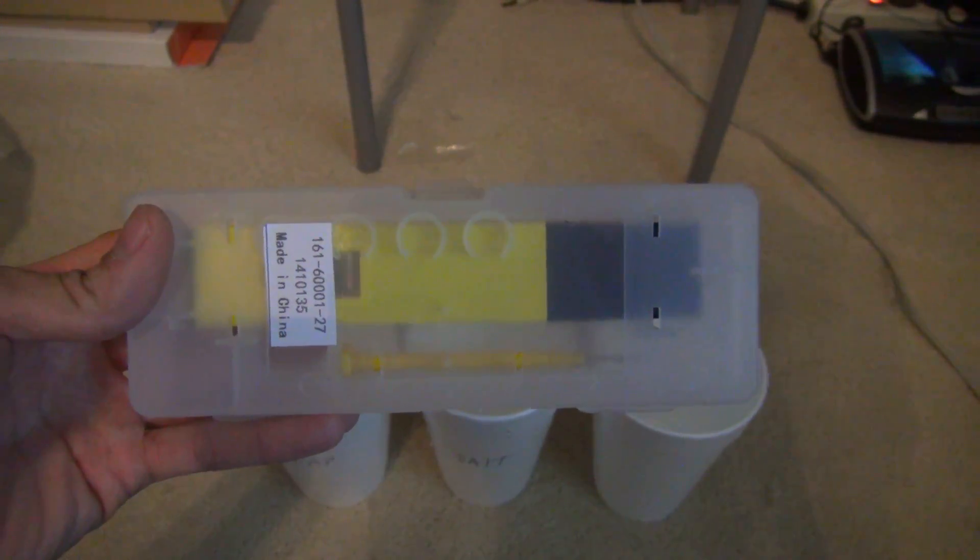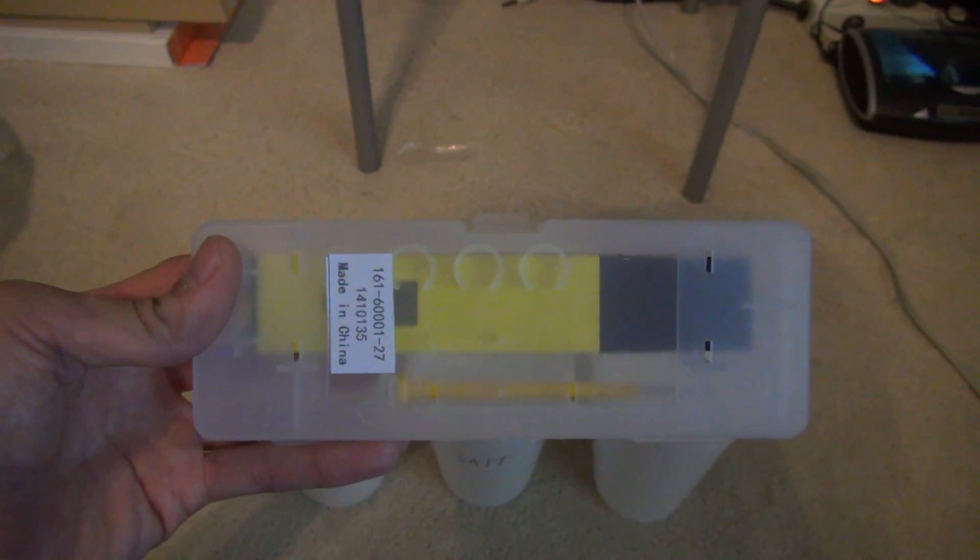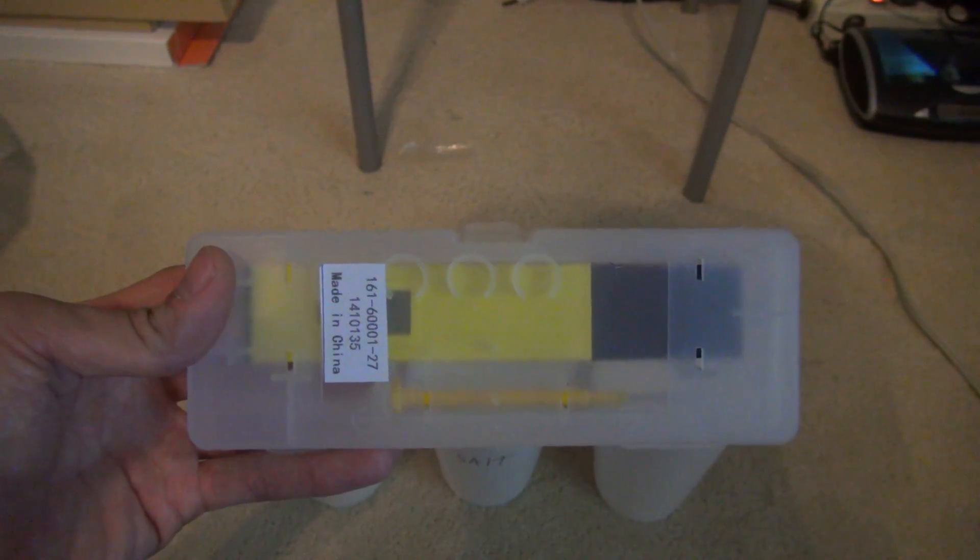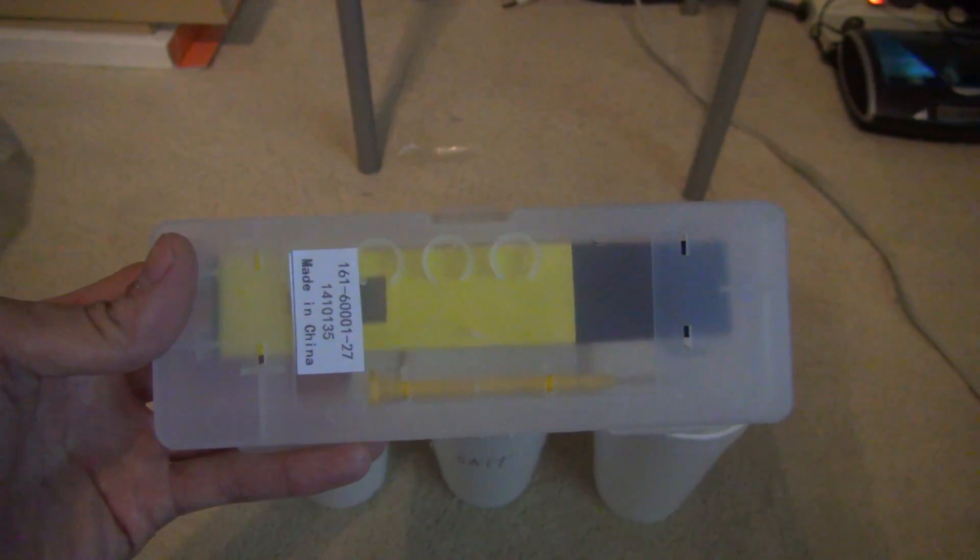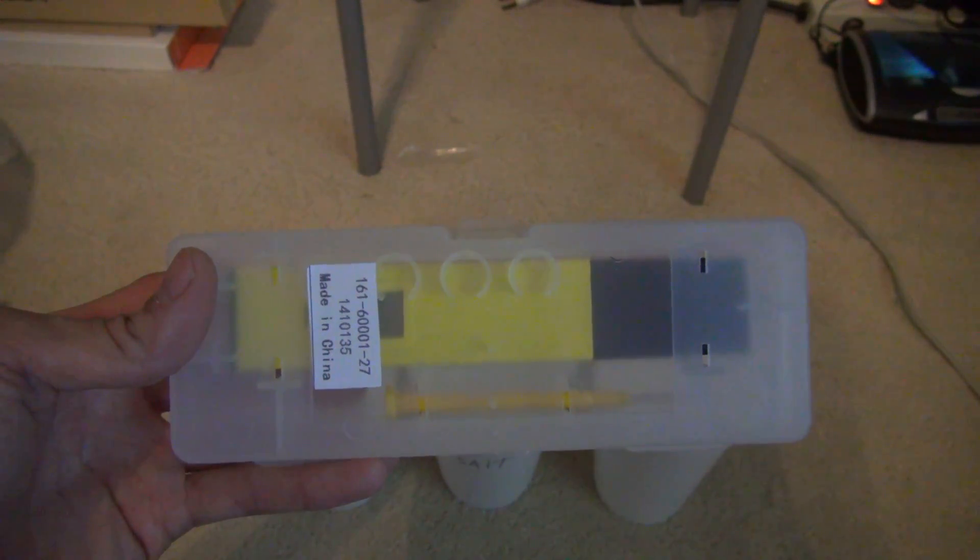Hi, I'm doing a product review for HisGadget. This is a Dr. Meter PH002 high accuracy pocket size meter with automatic temperature compensation.